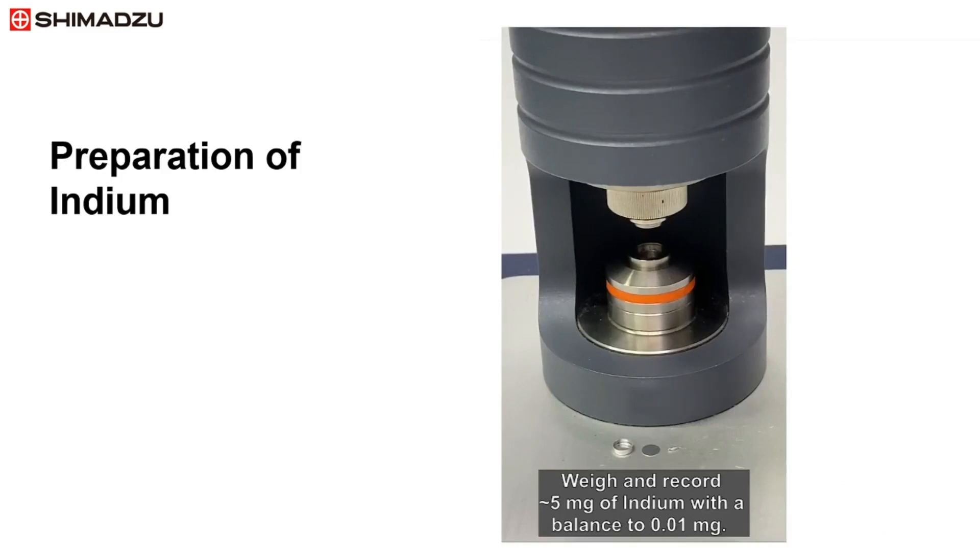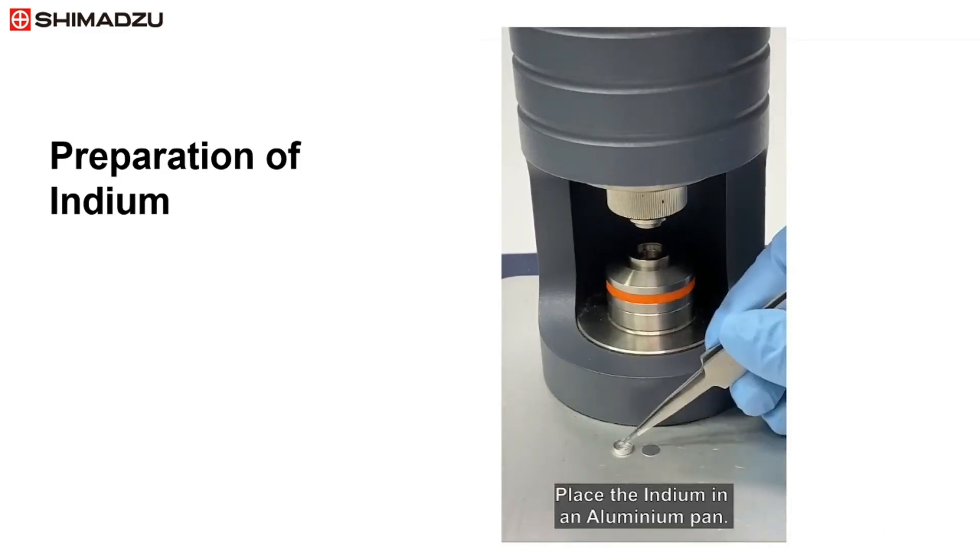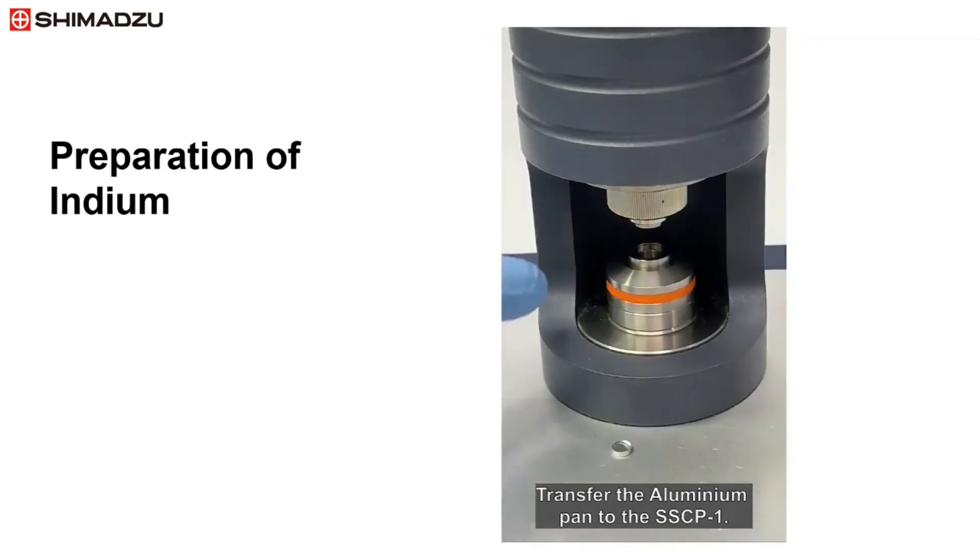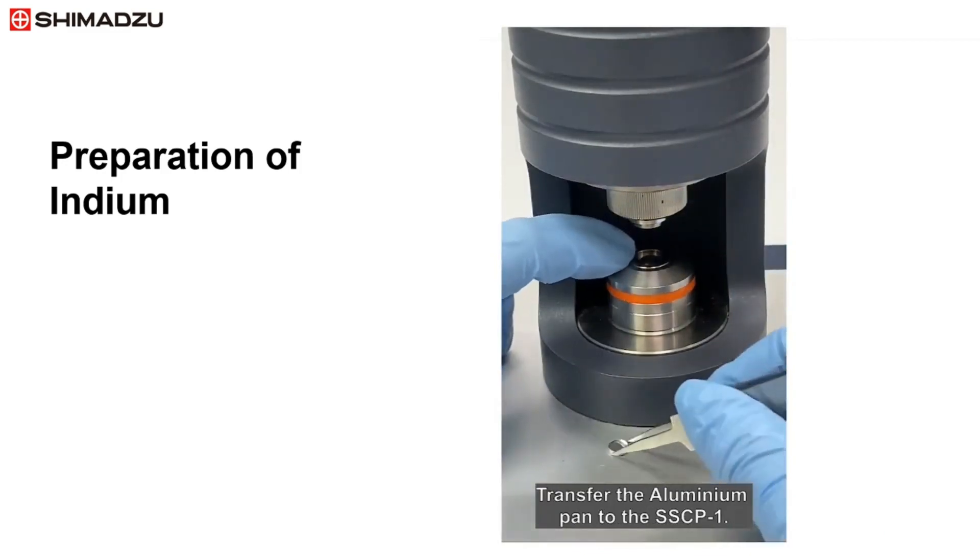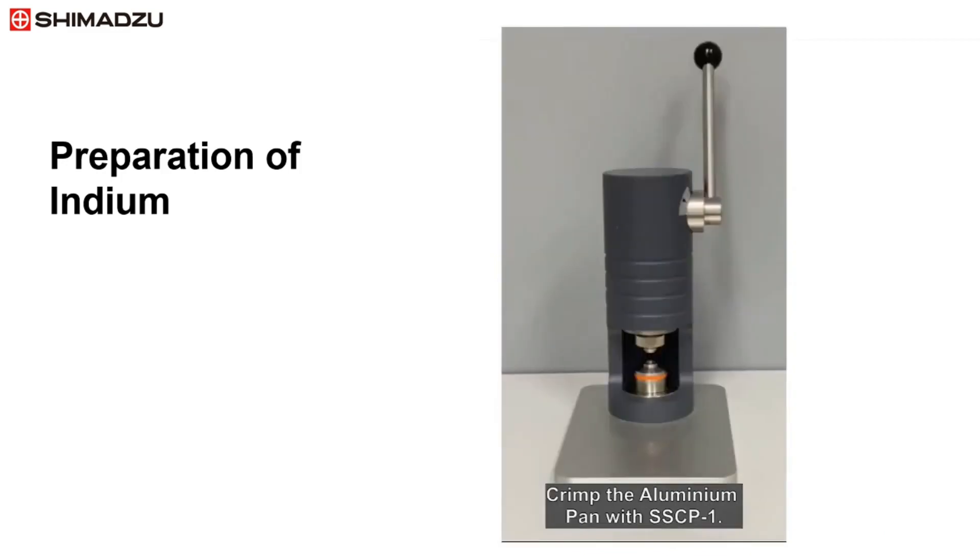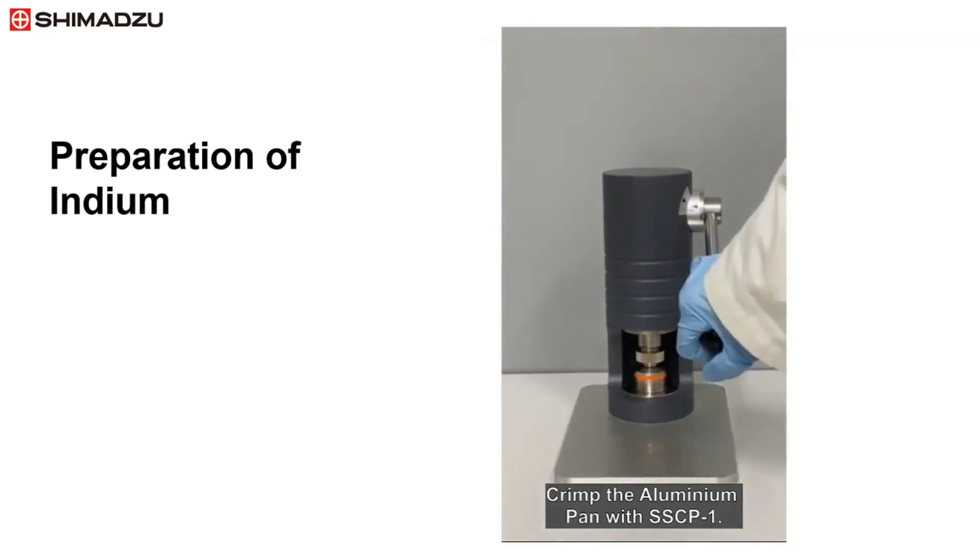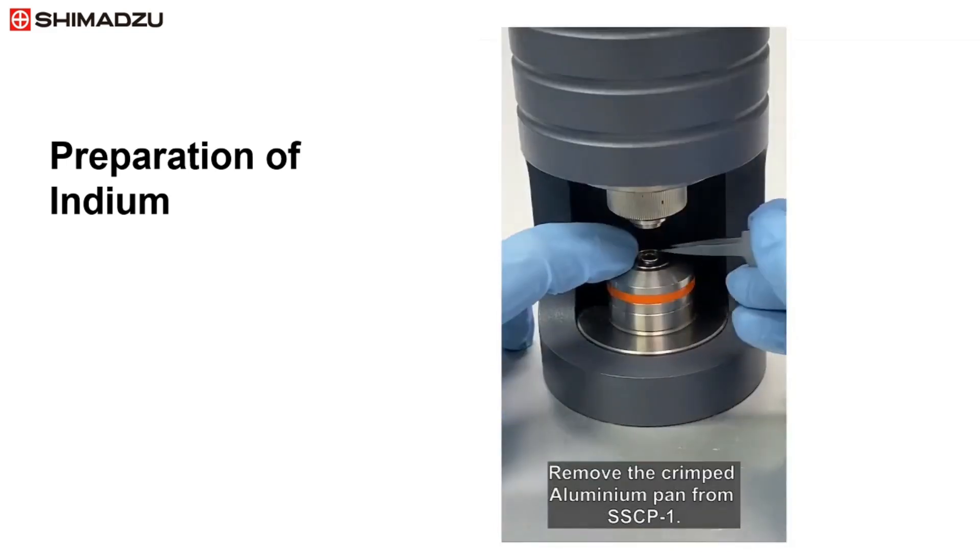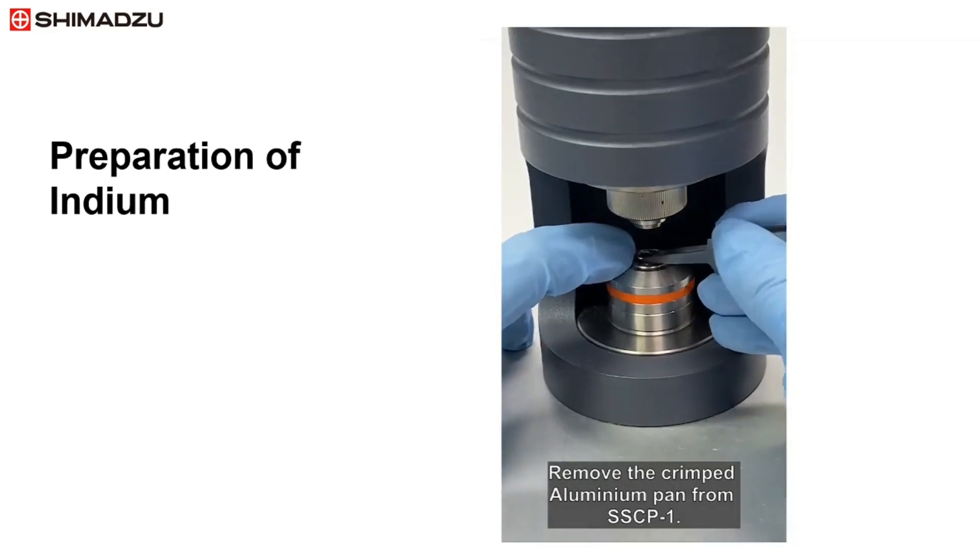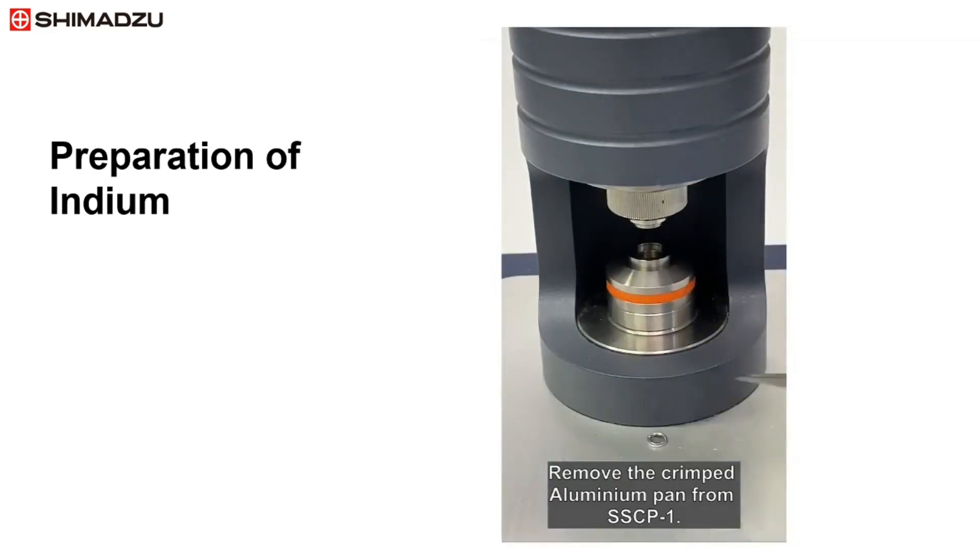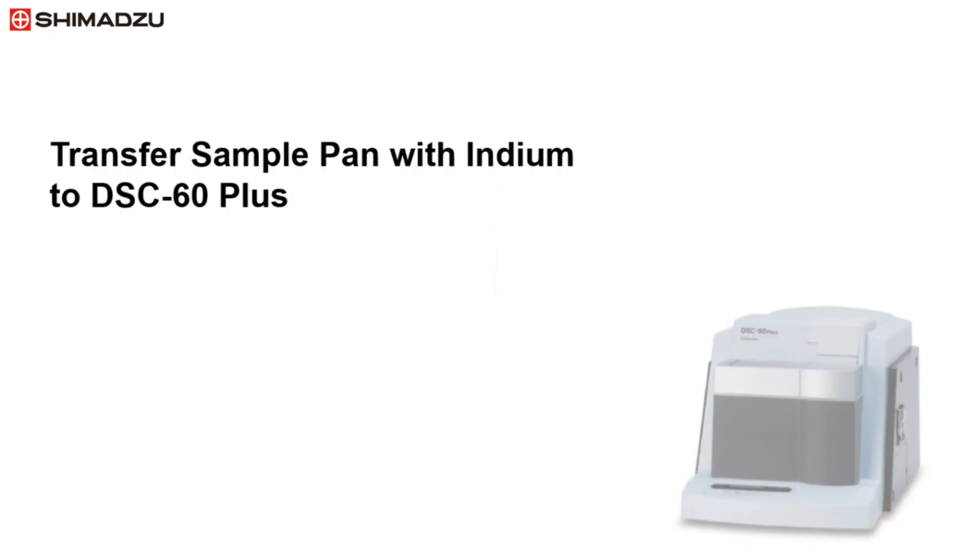Weigh approximately 5 milligrams of indium. Place the indium in an aluminum pan and transfer the aluminum pan to the SSCP-1 crimper. Crimp the aluminum pan with SSCP-1. Remove the crimped aluminum pan with indium.